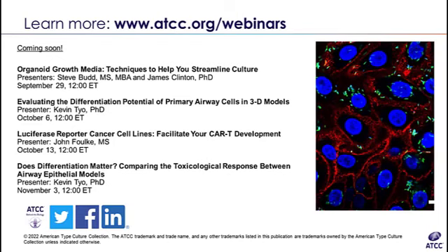And then going into long term, like you suggested, the CO2 tank going out and not hearing the alarm go off, that can definitely have an effect on the cells. The biggest concern is that without that excess CO2, the media is going to become pretty basic.